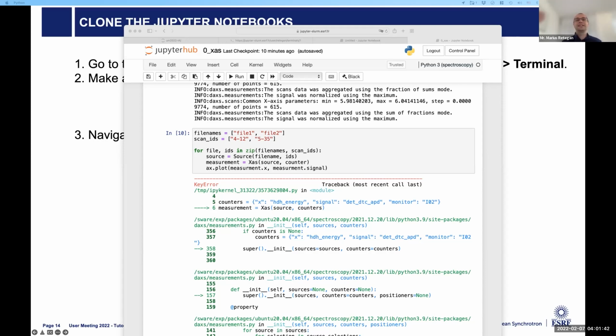So yeah, as I said, there is a lot of power because you can use this type of for loops. You can go quickly over a very, very large number of samples. In principle, here I could have, I don't know, 20 or 30. I did analysis like this for 20 samples, and you just enter the file name, the scans that you want to process for each file name, and then you do the analysis, and that's it.